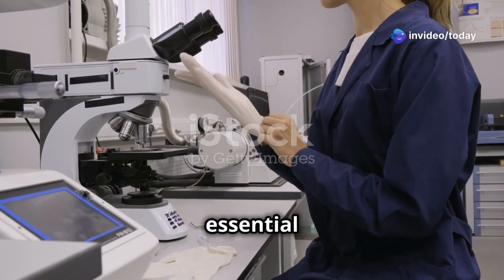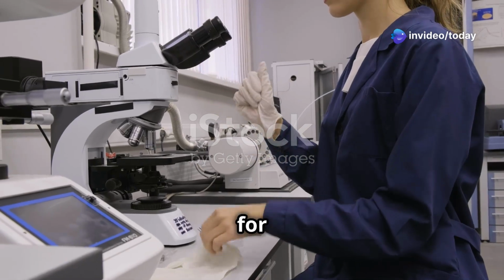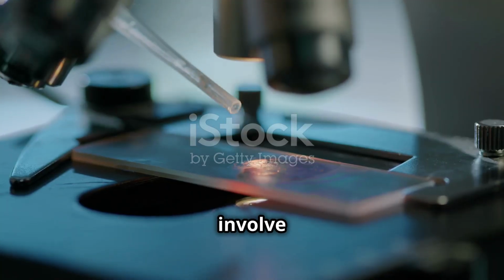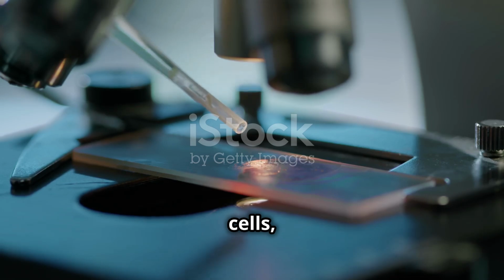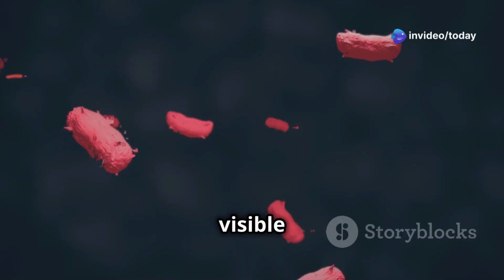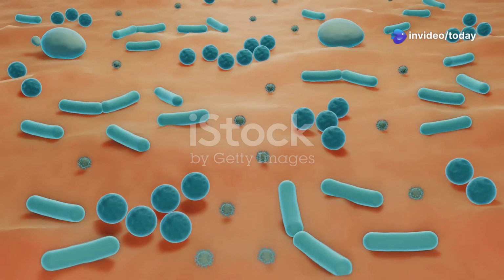Staining techniques are essential tools in microbiology for visualizing and identifying bacteria. These techniques involve applying dyes to bacterial cells, which enhance their contrast against the background, making them more visible under a microscope.